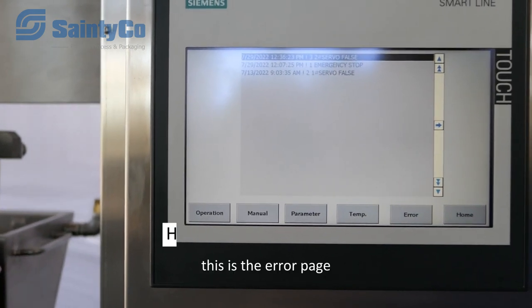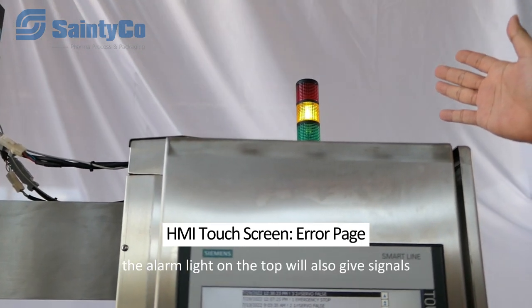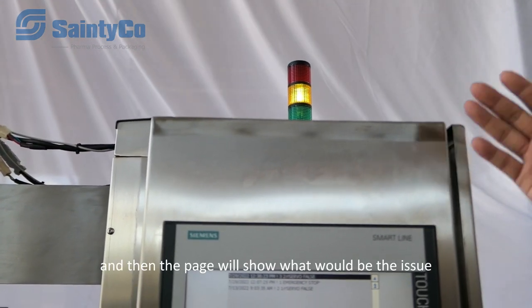This is the error page. If any emergency or issue happens, an alarm at the top will give a signal and the page will show what the issue is.